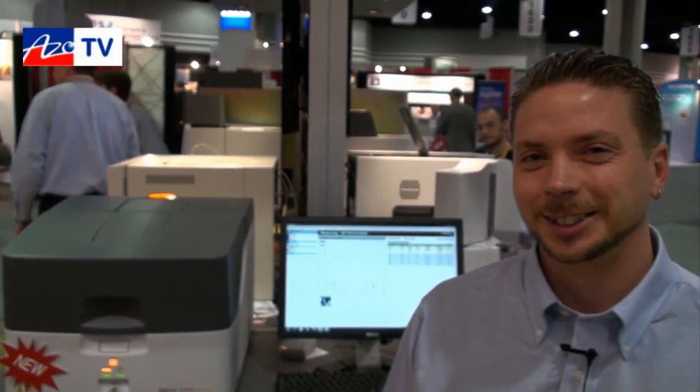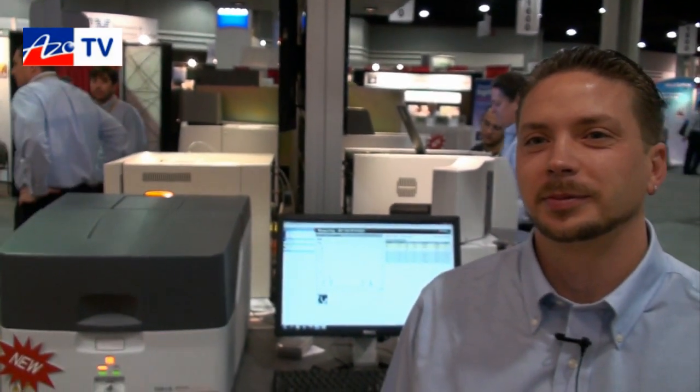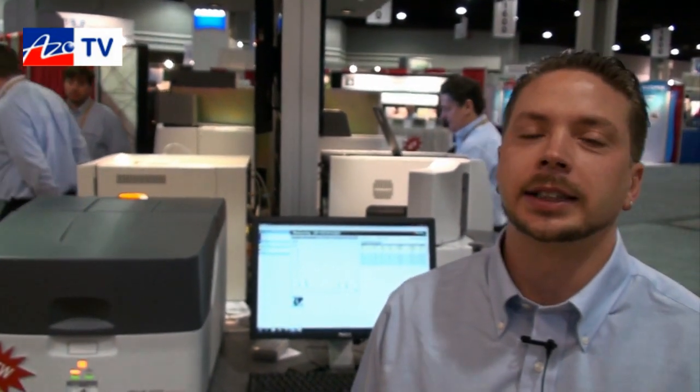Dan, thanks very much for telling us about the EDX LE. If anybody wants more information on that, they can go to your website. Yes, that's www.shimadzu.com.